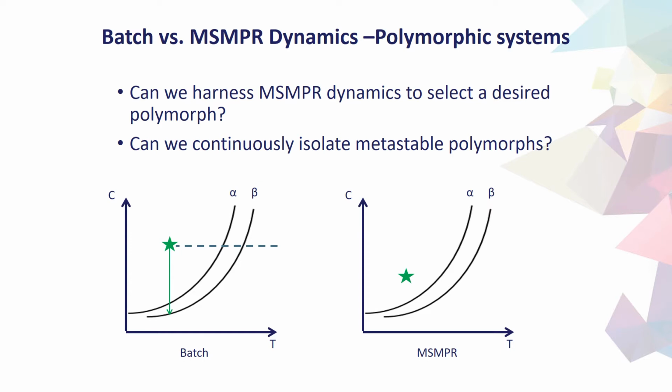So maybe to start, we'll look at a phase diagram again and look at the dynamics of the systems as we did previously for particle size control. So this is a monotropic polymorphic system, actually glutamic acid here, although not labeled. And these are temperature dependent phase diagrams. So as the temperature goes up, the thermodynamic or the maximum stable amount that can be dissolved in solution goes up. Hence the liquid phase concentration that can be dissolved goes up.